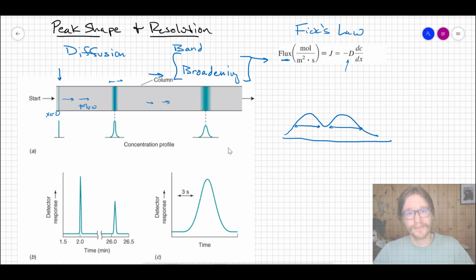The retention time difference will grow further apart. But at the same time, the full width at half max or the width at their base also grows. And so those two things are sort of working inverse to each other when it comes to separation. There's tricks, which we'll talk about, which give rise to different things that we do in chromatography and actually different techniques in chromatography in general.